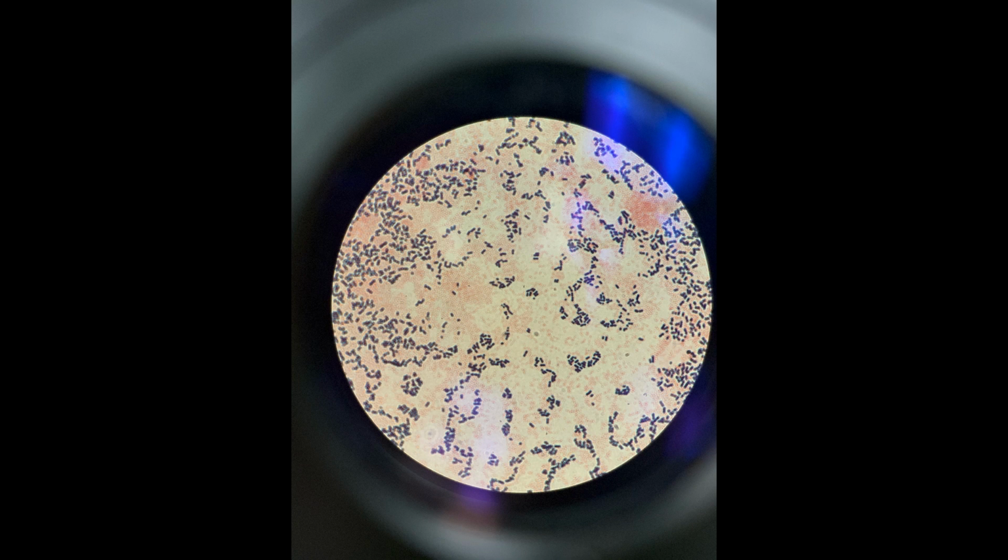Because I know I gave you the analogy in class sometime last week or the week before. Just because you read a recipe on how to make beef Wellington doesn't mean that Gordon Ramsay's going to want to eat it the first time you make it. So the first time you do a gram stain, the second time you do a gram stain, the third time you do a gram stain, it may not turn out very well. But with lots and lots of practice and patience, you can develop the skills to do a gram stain properly, and you'll know you've done a gram stain properly when you see something like this, a mixed culture, gram-positive and gram-negative, where both cell types are the appropriate color.